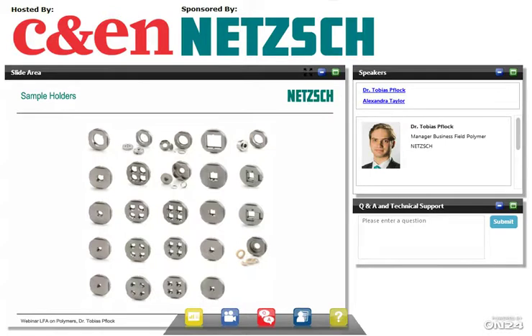I doubt that you would get the same value for a powder sample and for a film sample with respect to the height, but I don't have any results in mind right now. This is something that I would maybe ask our specialists in the lab if we have comparisons like that. But I would say maybe you just come back on that and we check that.